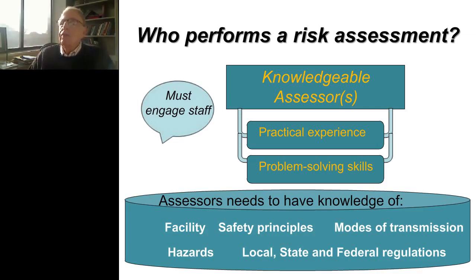The assessor needs to have knowledge of the facilities, safety principles, modes of transmission, the hazards, and the regulations that we're all under, whether they be local, state, or federal. So consequently, with all that someone needs to have knowledge of, a team approach is the most efficient.